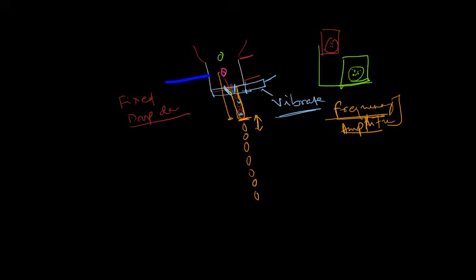So if I want to collect the green cells, the cells that are bound to the green fluorescent molecule, and then we have cells that are bound to the red fluorescent molecule. If I want to collect the red cells to the right and the green to the left, it's not that green has to go to the left always. I can reverse it depending on how I select.